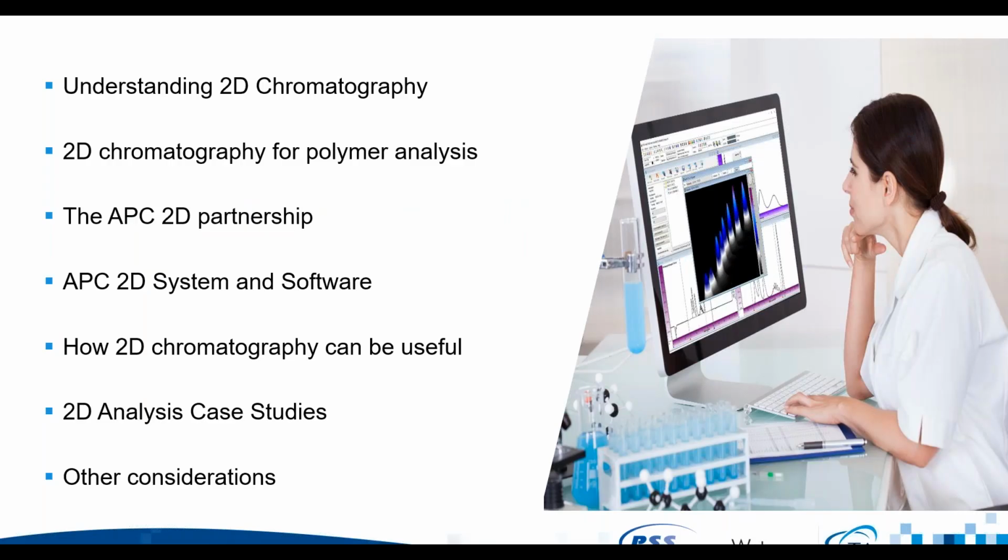Okay, so as Ben has kindly introduced us, I won't bother doing that. And as Ben said, thank you for attending today to learn more about comprehensive 2D polymer chromatography. So we're starting at the advanced end of polymer separations and chromatography in general. But as I said, hopefully we don't baffle you. And luckily we're starting with a slow introduction of where this is relevant, and the numerous ways it could potentially help your polymer analysis either now or in the future.